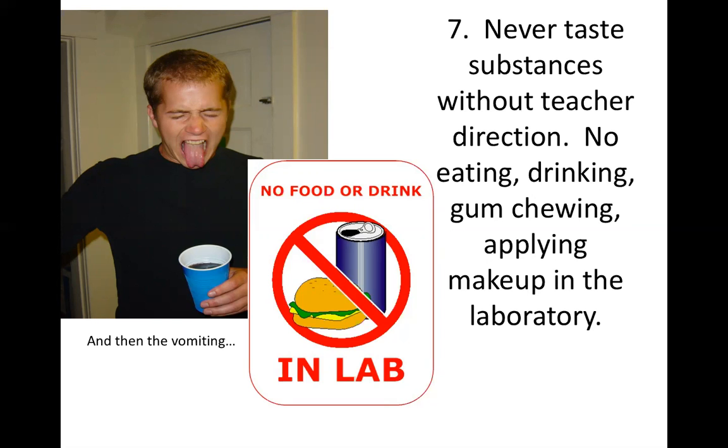No eating, drinking, gum chewing, and applying makeup in the laboratory. Why? Because there are chemicals in the laboratory. If you eat or drink, you do not know if the food that you're eating or the drink that you're drinking is contaminated with some of the chemicals inside the laboratory. And if you drink and eat contaminated food, then you are ingesting chemicals that may be bad for your body. So generally, eating and drinking is not allowed inside the laboratory.